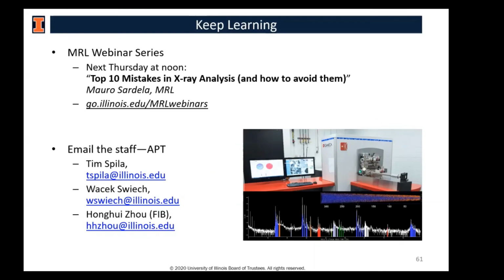I think Wojciech's muted, so I'll say that in general, no. The samples themselves come on a little silicon coupon, and so those generally aren't a problem. And if you're dealing with wire samples, those will probably be conductive anyway, so charging generally isn't a problem. That being said, as Wojciech mentioned a little bit with the production of samples, the very sharp tip is very important, and static charge can have an effect. I don't know if he wants to say some more.